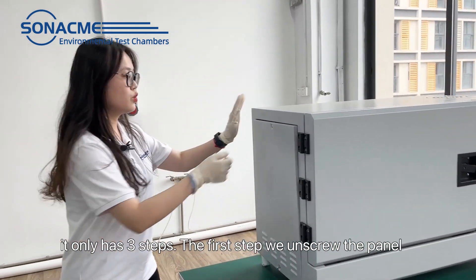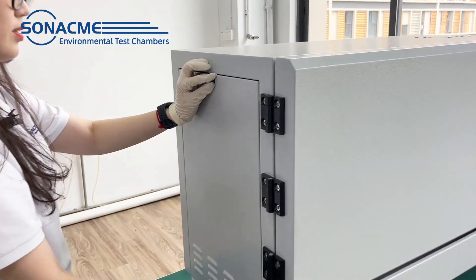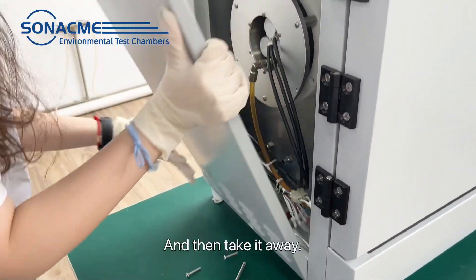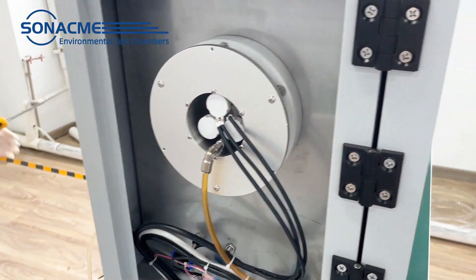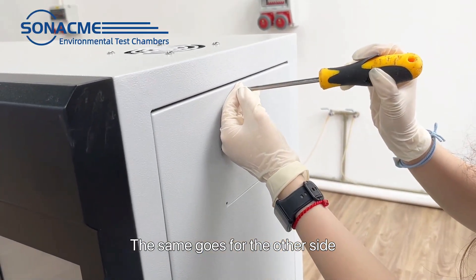The first step: we unscrew the panel, and then take it away. The same goes for the other side.